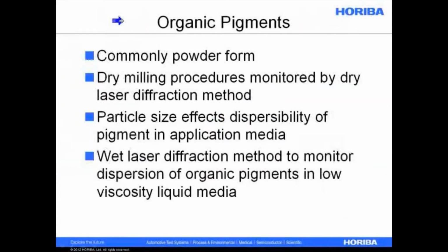We'll start today when we start looking at case studies and applications with organic pigments, which are typically in the powder form. And we have lots of customers who just use like an LA950 or maybe even an LA300. I guess in this case for dry monitoring, it's always the LA950. But if you're doing dry milling and you want to measure it as a dry powder, you can just take the sample as you're milling it, bring it over to the instrument, perform a quick measurement, and find out when you've reached the endpoint of the desired particle size distribution as you do milling.